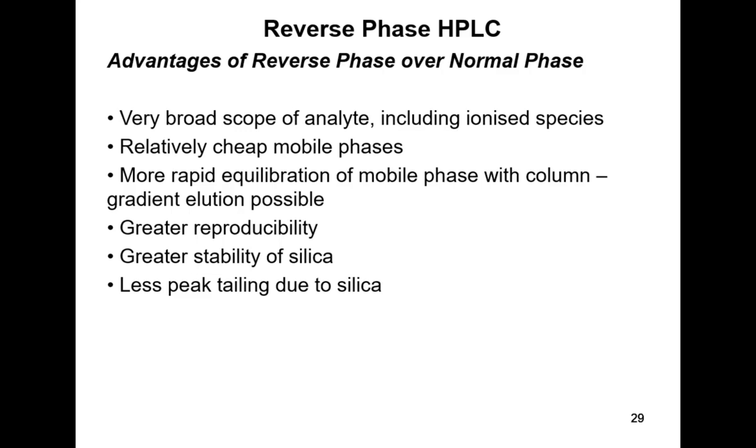So reverse phase, although it's a little bit more expensive in terms of the stationary phase, the mobile phase is generally going to be a bit cheaper because it's mostly water that you're using. But it's become the standard technique, the default technique to use.